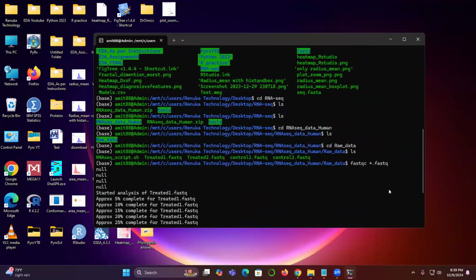So these are some Linux commands. So cd means to change the directory. If you want to work inside a folder, that time we use the cd command, as he has written cd RNA-seq. Why? Because I want to go inside this RNA-seq, right? Just highlight that, Amit. No, below that. Can you see that before this link there is a desktop, right? Yes. And after writing cd RNA-seq, now it went to the RNA-seq folder. Can you see that? Yes.